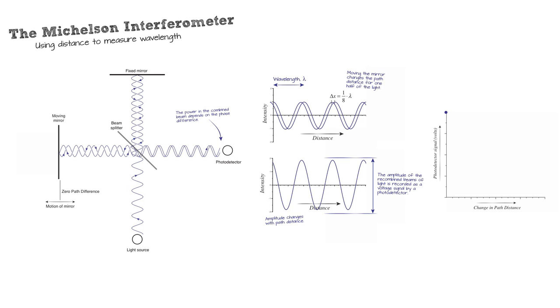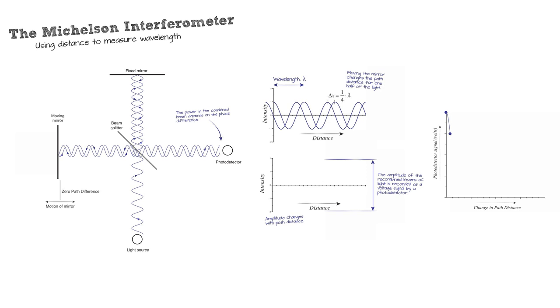Well, let's measure it. Let's take our caliper here and measure that. And what do we get? Look at that. Less power. All right, so let's take our wavelength here and let's move it a tiny bit more. All right, now we're a quarter wavelength in the difference. Well, there's what we add up to. Notice less power. Let's measure.